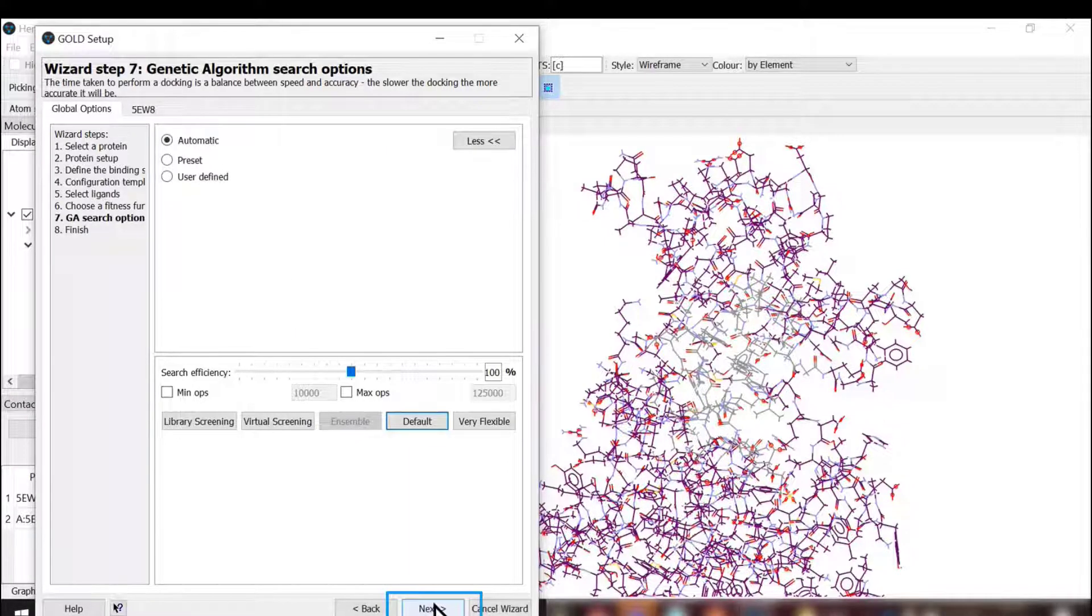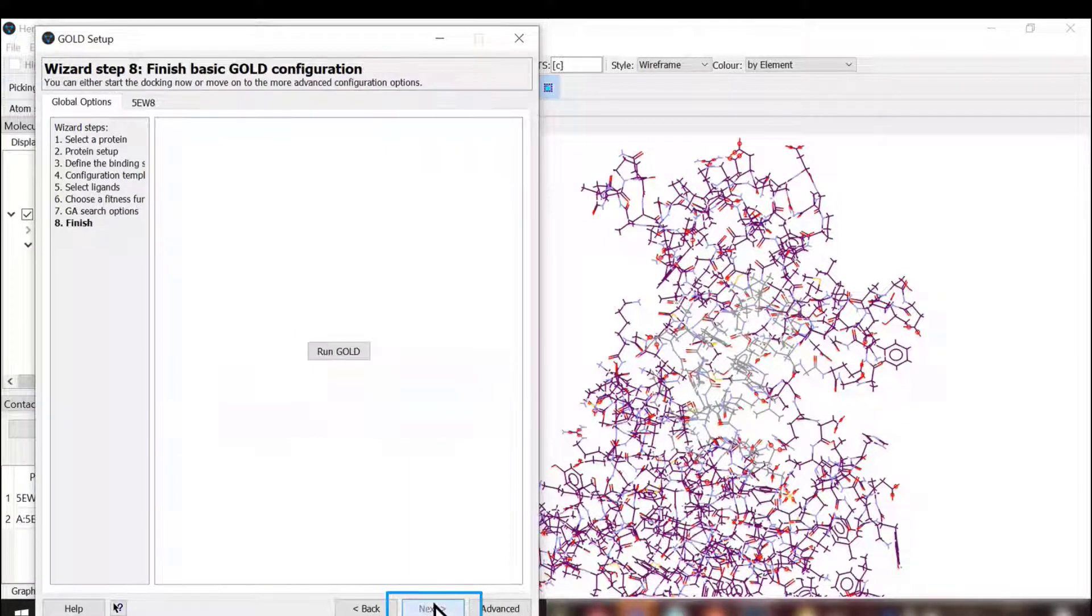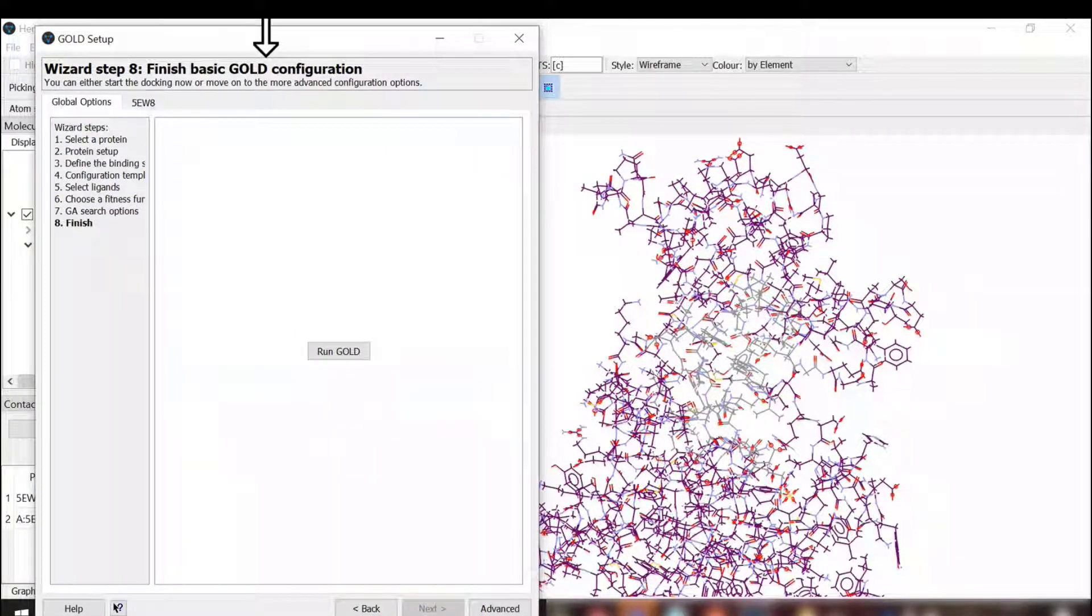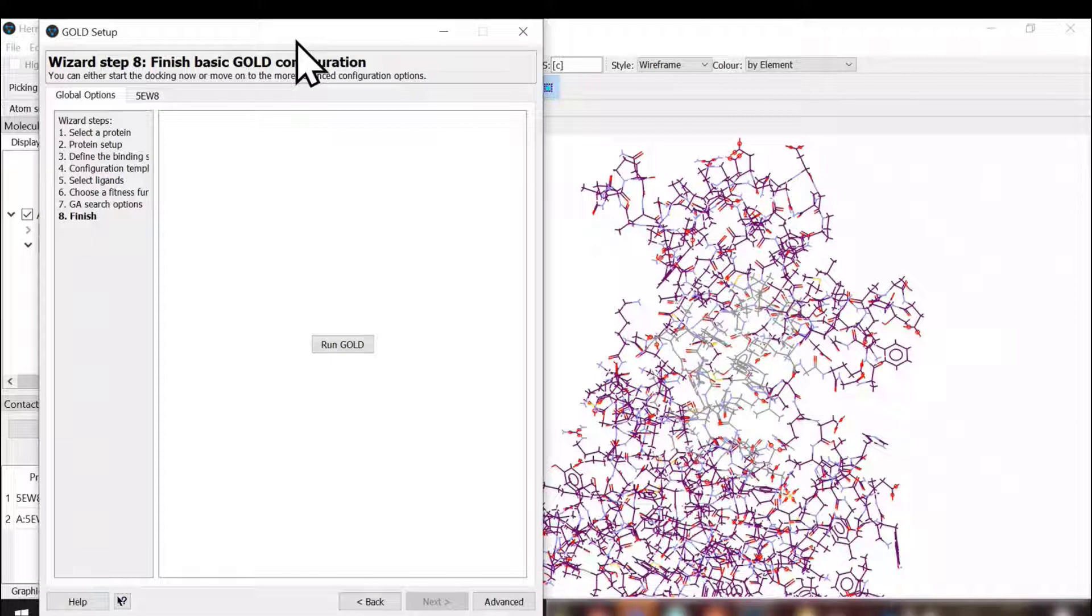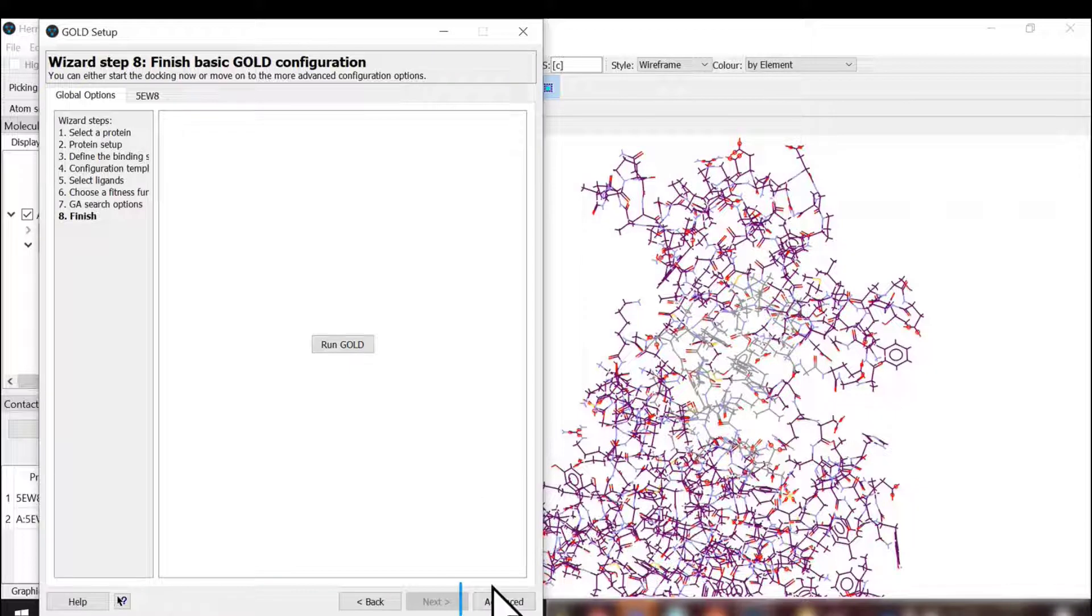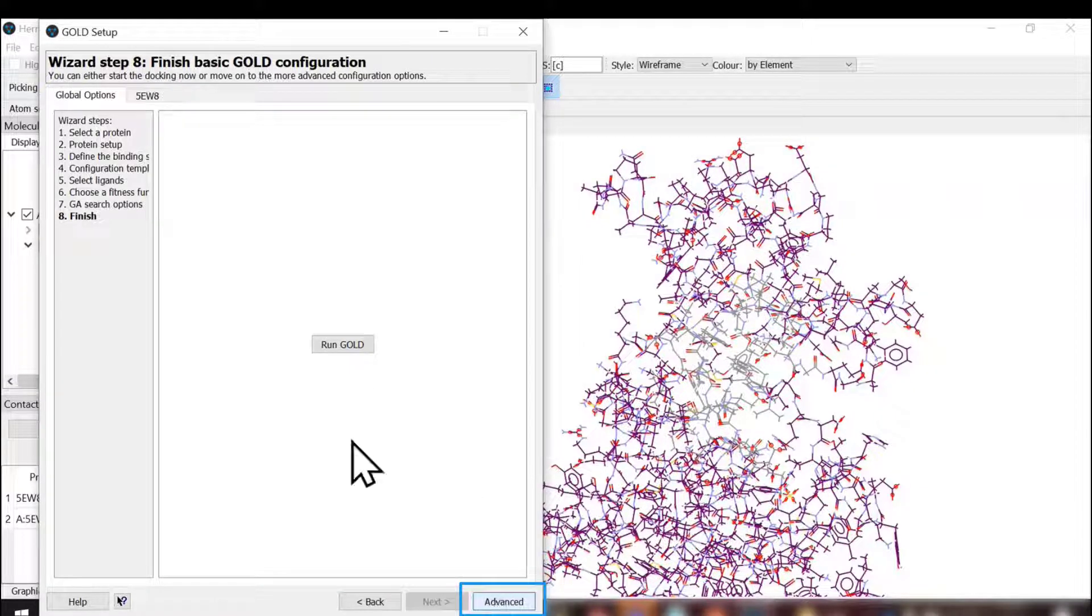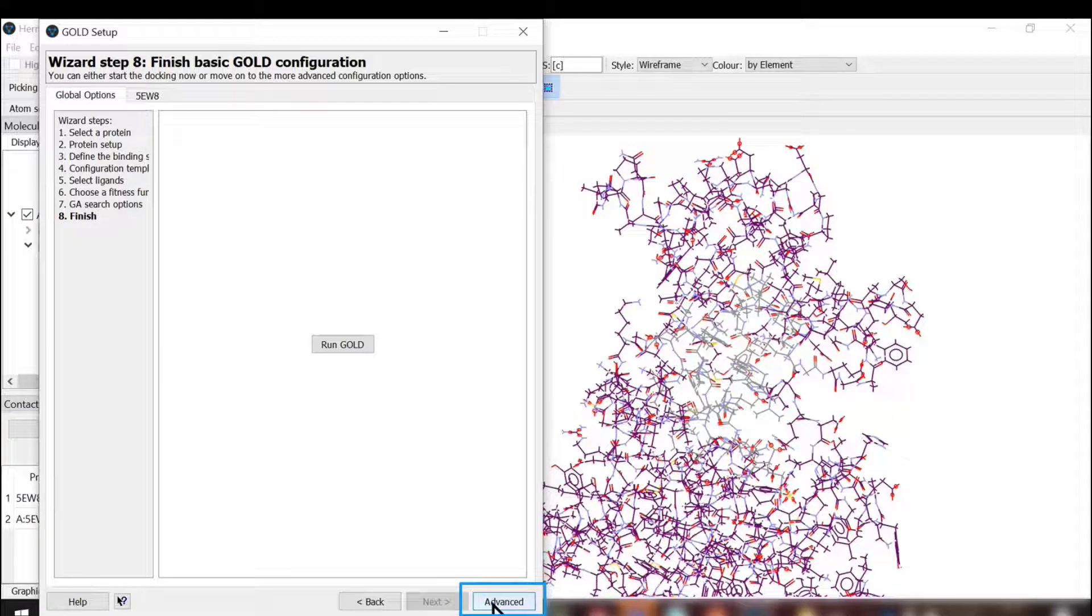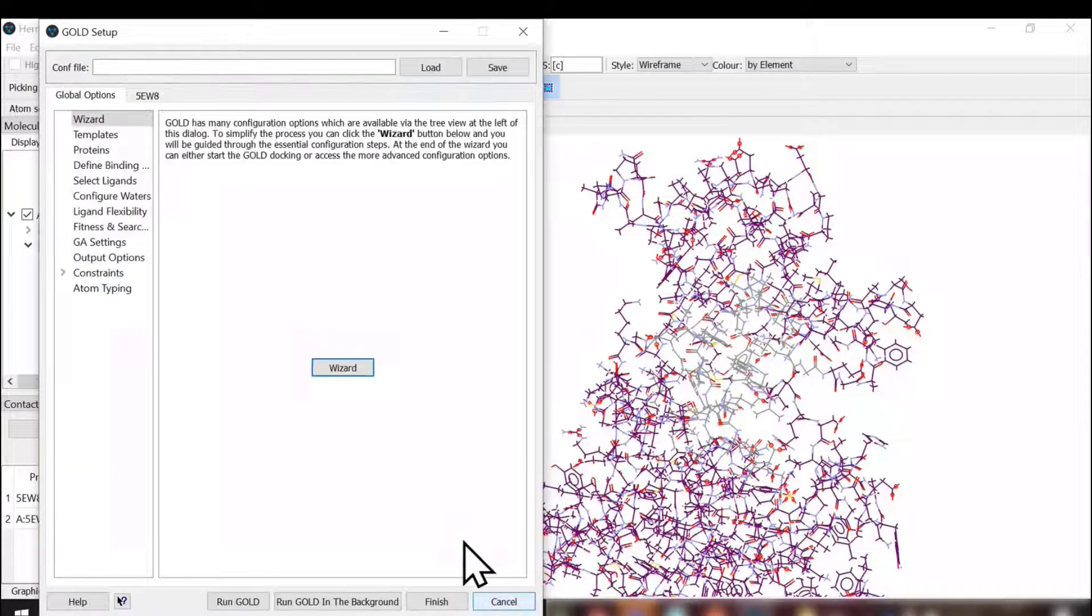Here we finish with the basic GOLD configuration setup. At this point, we will not run GOLD, but we will explore what advanced options are available with GOLD.